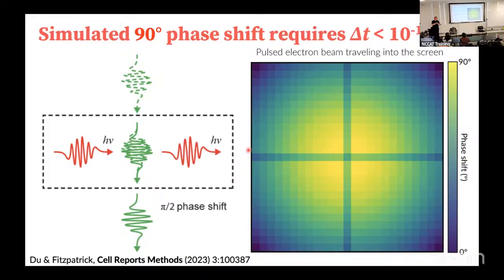But the actual path itself, the electron is only passing through a diameter of about 3 millimeters. So you want to be able to send the laser in, pass through that area, and then leave through the other side. You don't want any physical device inside the microscope. So you have the photon come in, change the phase of the electron packet by 90 degrees. That's what this overlay is supposed to mean. Once it comes out the other side, you have this 90-degree phase shift in the electron packet, and the photon goes on its way.